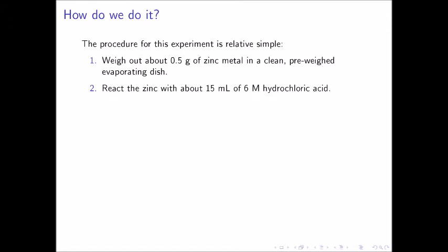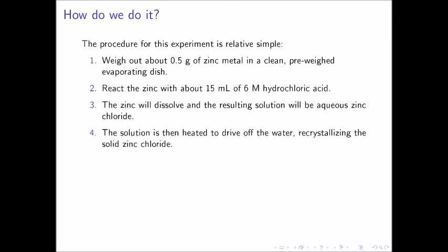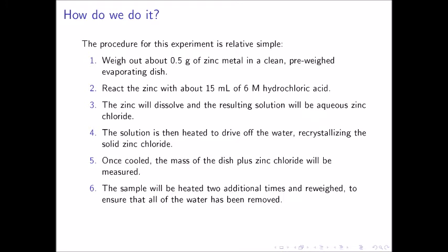If you do happen to spill some on your skin, immediately wash your skin very well with soap and water and inform the instructor. Third, the zinc will dissolve and the resulting solution will be aqueous zinc chloride. Fourth, we then heat the solution to drive off the water, thus recrystallizing the solid zinc chloride. Fifth, once this is cooled, the mass of the dish plus zinc chloride will be measured. Sixth, the sample will be heated 2 additional times and reweighed. This is to ensure that all of the water has been removed. And finally, the masses can be used to calculate the mole ratio.